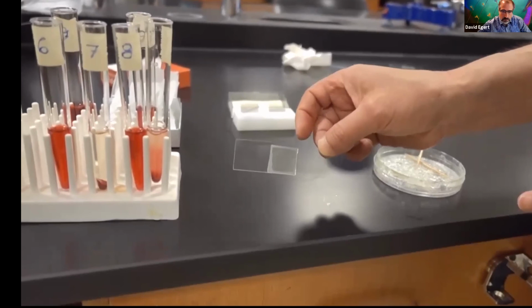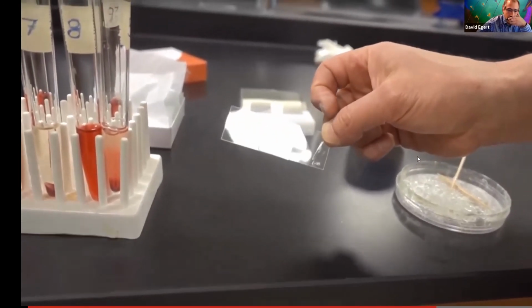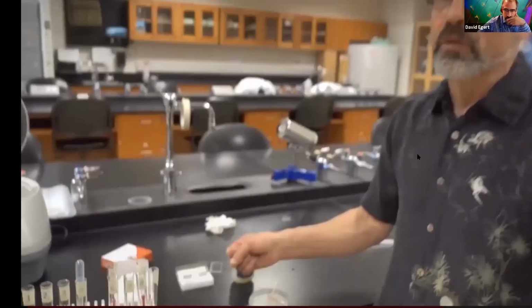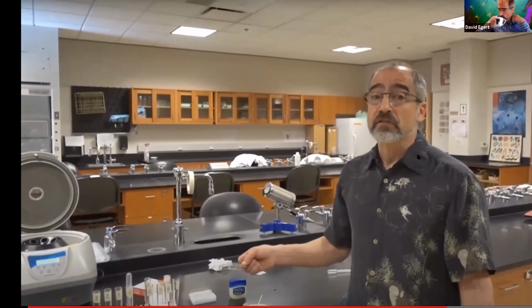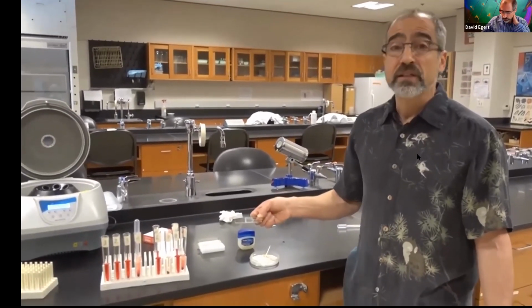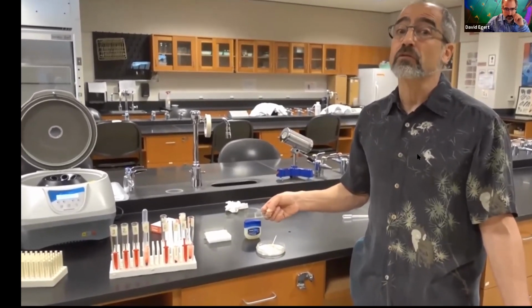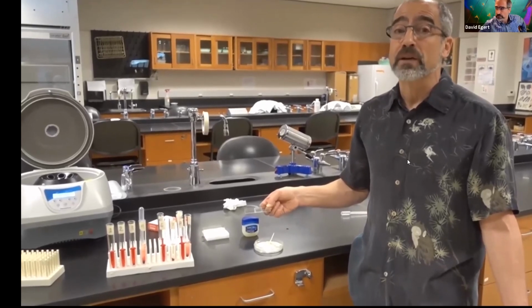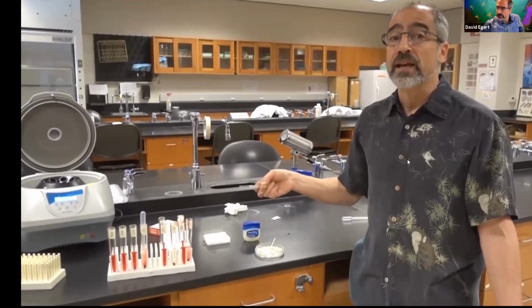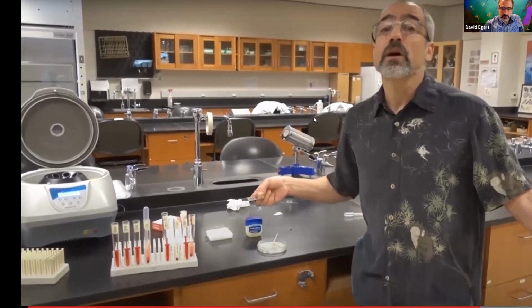The blood suspended in solution is sealed inside the Vaseline underneath there. So this can be sitting around now for like half an hour, and it's not going to change. It's a bit of a production to actually do this sealing, but if you didn't, like 10 minutes from now, you'd probably start having crystals under there as the water evaporates and leaves into the room. So this allows you to have a nice slide that you can come back to and show other people as well.